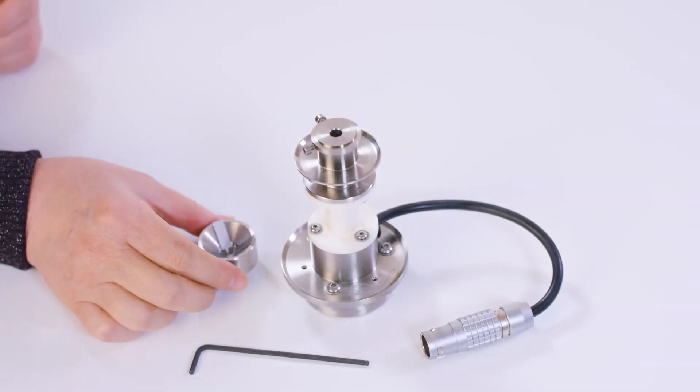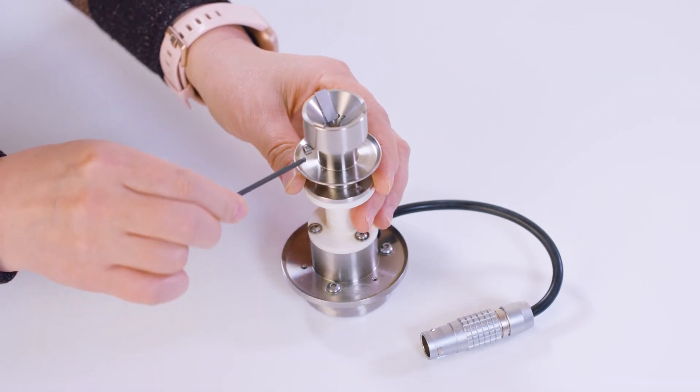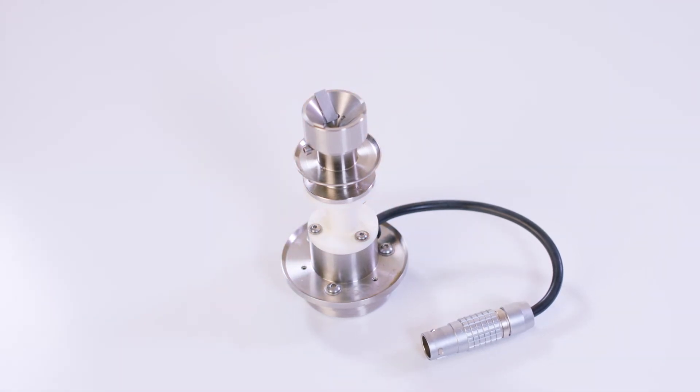If you're using the ETC oven as temperature control for your tribo-rheometry test, attach your three plates lower geometry to the ETC disposable bottom stage. Tighten the screws on the side, and then install this stage to the bottom of the rheometer.